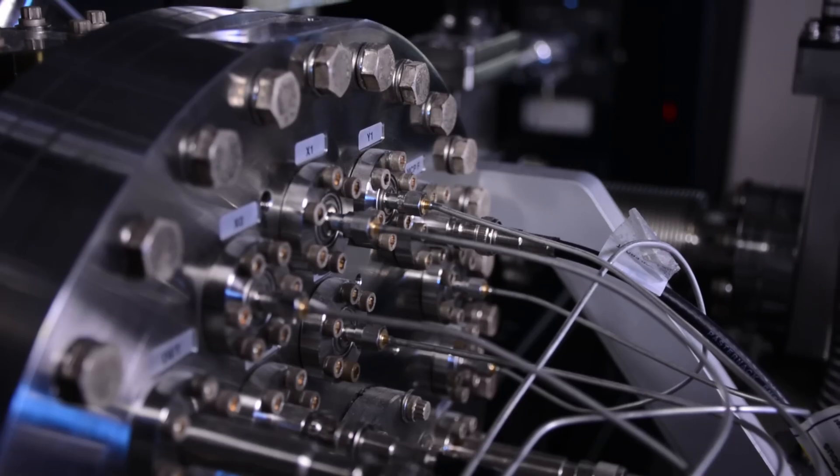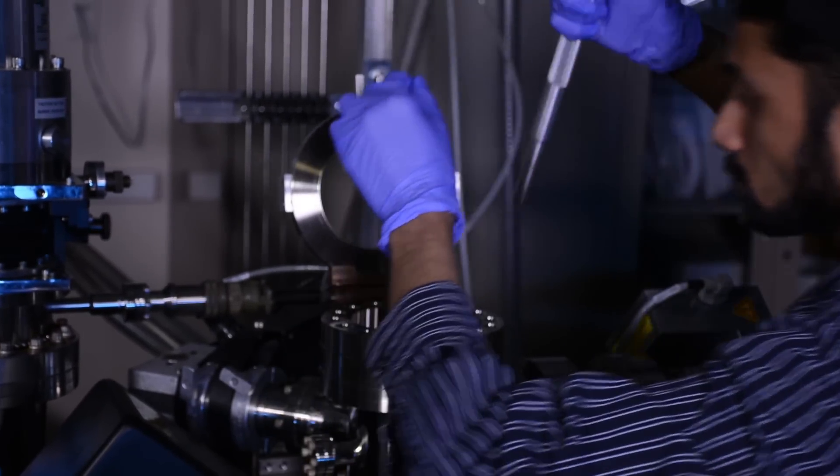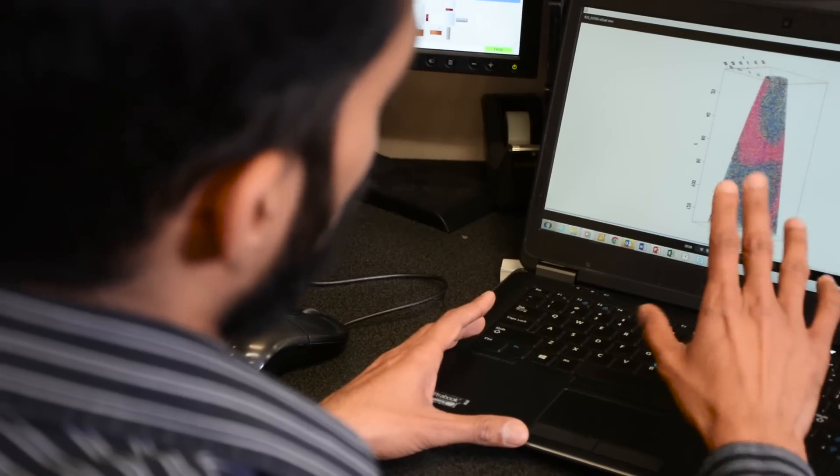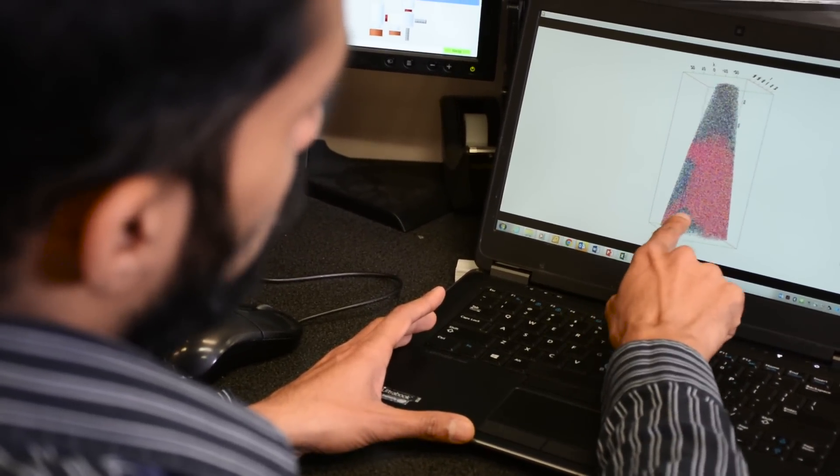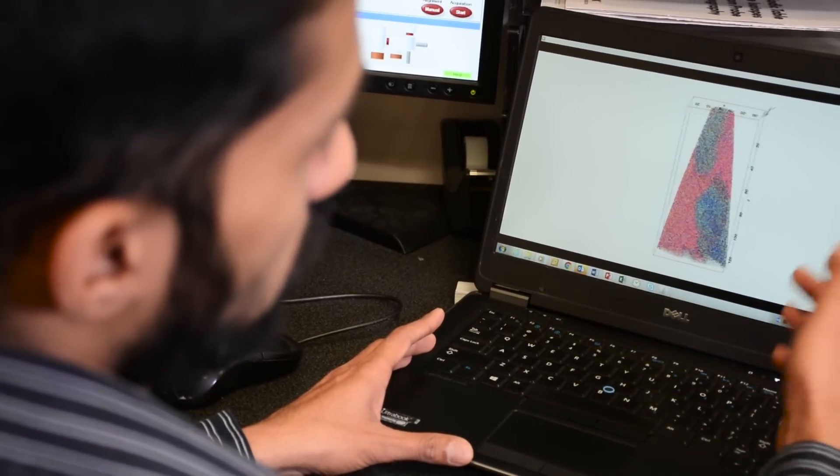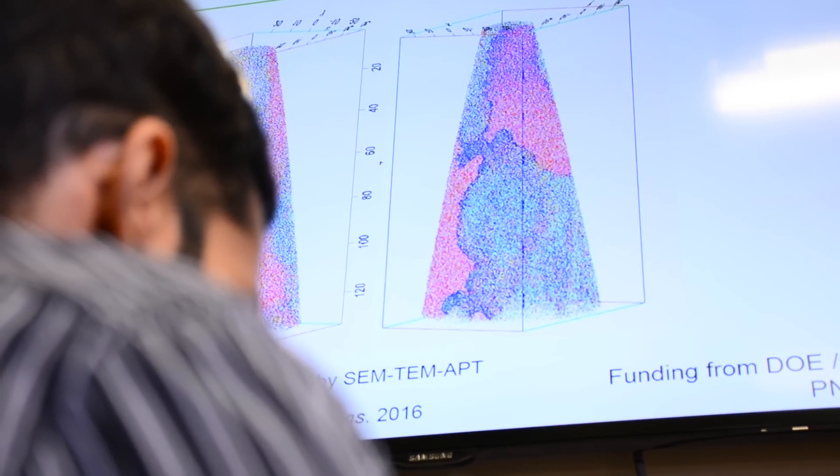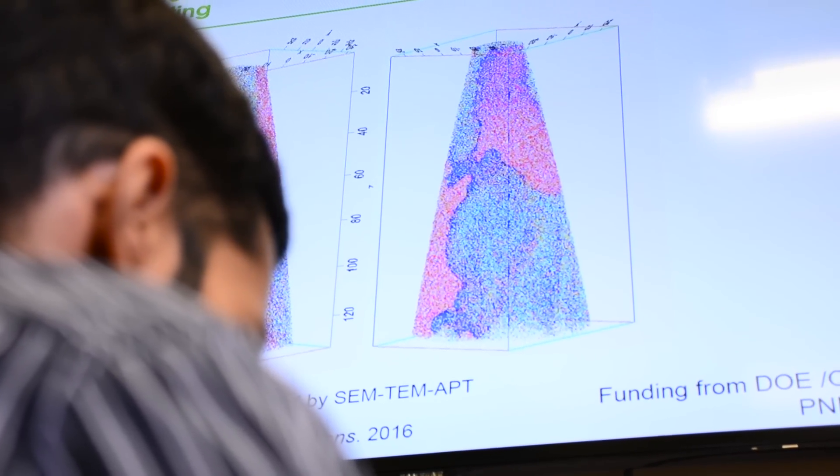To look at that, we did atom probe tomography, which tells you where the individual atoms are located at a really small length scale. So what we are looking at is how the atoms are distributed. The bluish regions denote all the titanium and aluminum atoms segregating to that region, and the red and yellow regions are the vanadium and iron atoms.